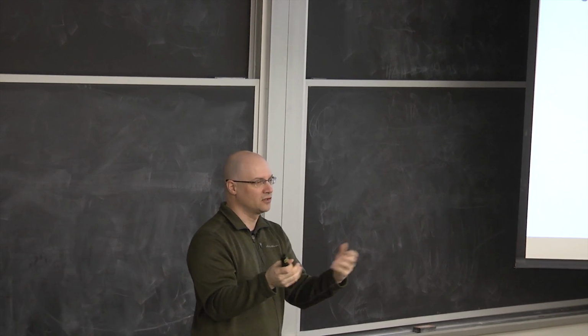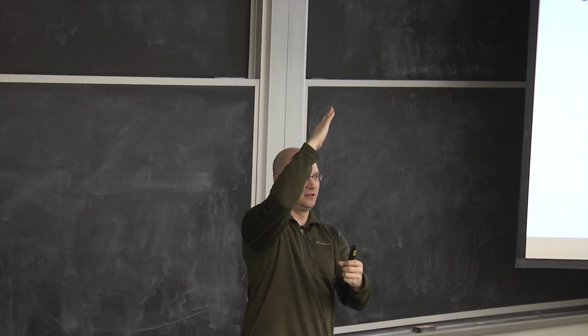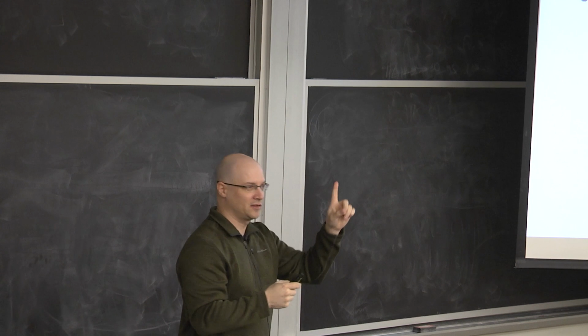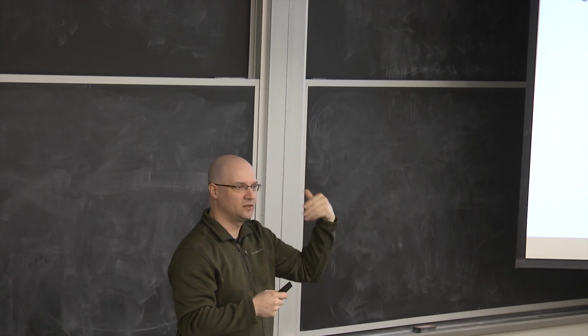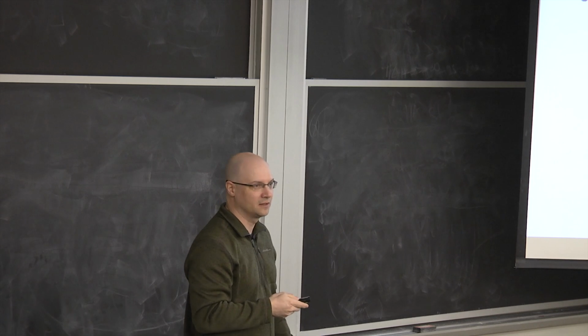So that's why you can take a strobe light and twirl something and it looks like it's sort of just stuck in space, because you've matched up the frequencies, right? This is awesome because now I can freeze out very fast repeating motions by timing up these frequencies just right. And that's what these car commercials do. It's called the wagon wheel effect, okay?